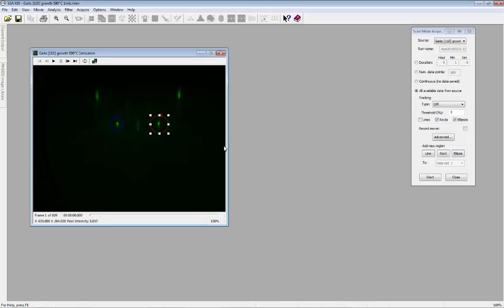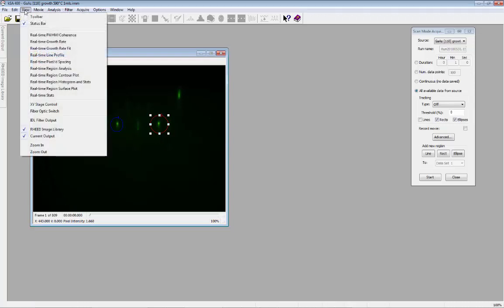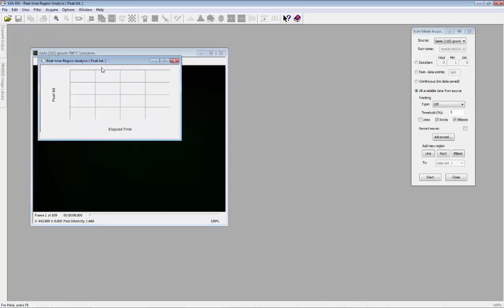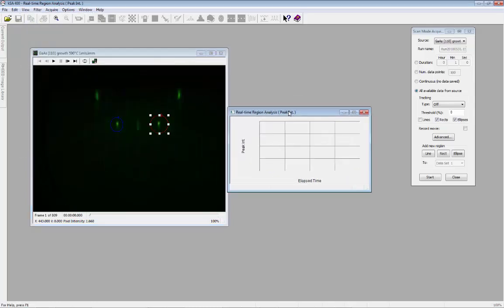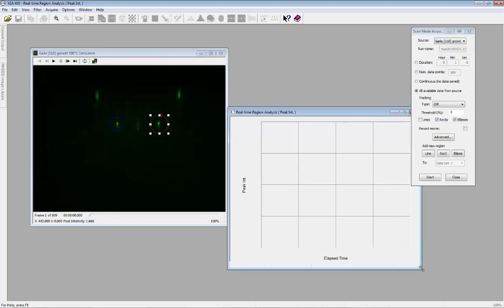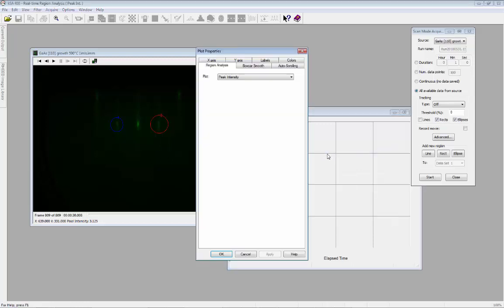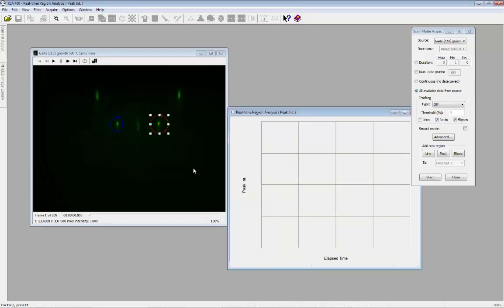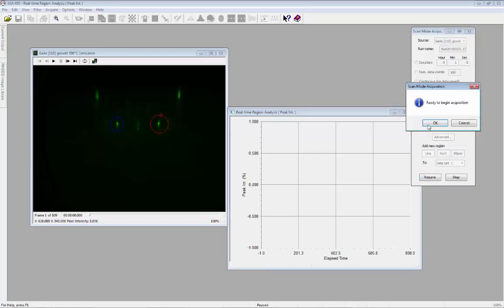From the View menu, select real-time region analysis. Right-click, select Properties, then select the Region Analysis tab and choose the value to plot. Ensure that the movie is rewound to the beginning and then press Start. Select OK to begin the acquisition.